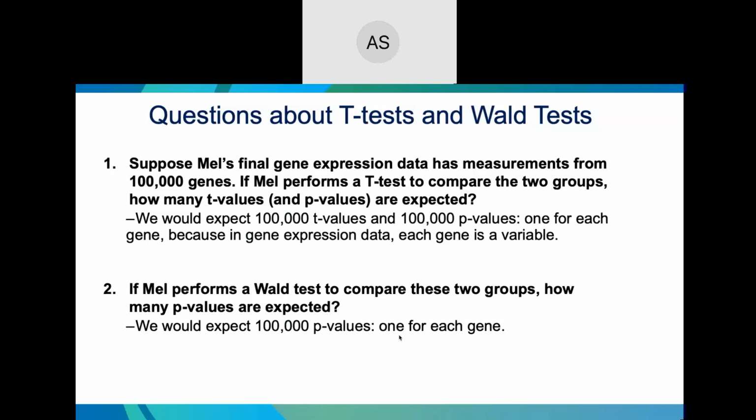Yeah, that's a great question. The t-test is ubiquitous, widely applicable, and sort of lowest common denominator a little bit. So it's not as specific as you can get with the Wald test. The great thing about the Wald test is that you can customize it for data sets that have different distribution types.